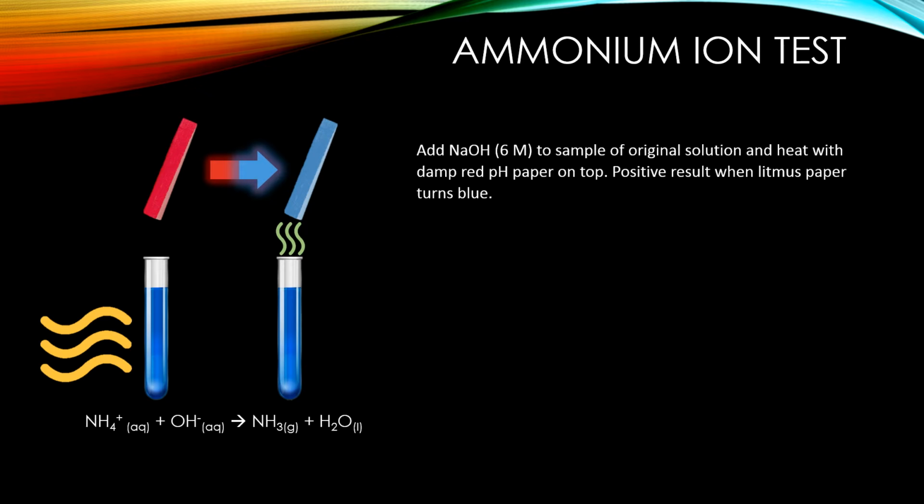The reason this is done at the start and not after all the other individual tests is because during those tests, NH3 is added as well to find other cations. This would lead to a false positive if there weren't any NH4 positive ions in there. So we do it at the start to ensure that we have either yes or no for NH4 positive ions.